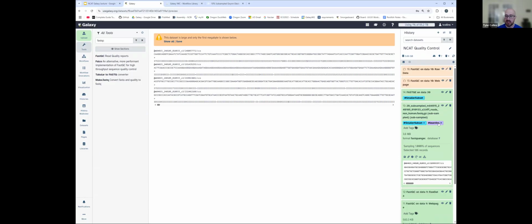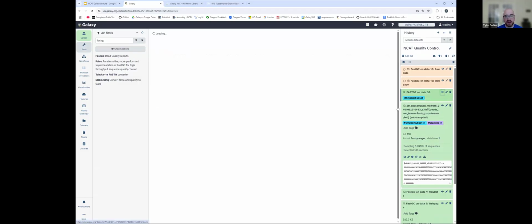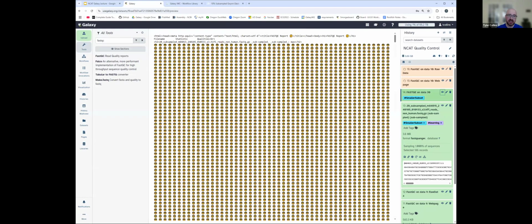And you'll see people add these by default in a lot of workflows so that when you run the workflow and it fills your history, it will auto add tags to make it easier to navigate. But the point of this is we did a heavy subsample on this data so that we could run a program called FastQE. FastQE takes a little bit longer to load here as compared to FastQC, although you'll soon find out why. It's another method of looking at quality control in our data.